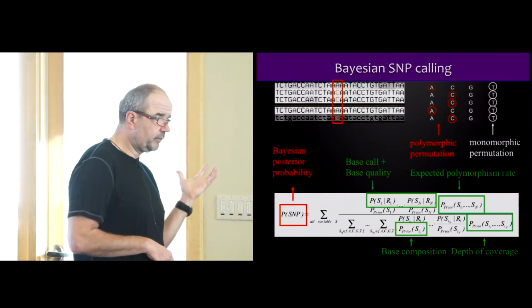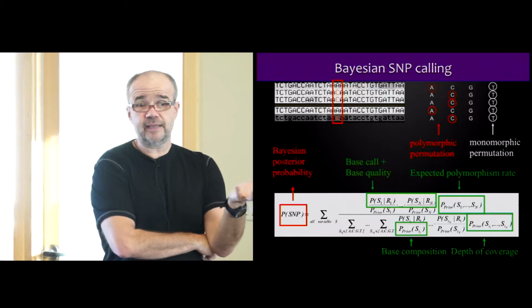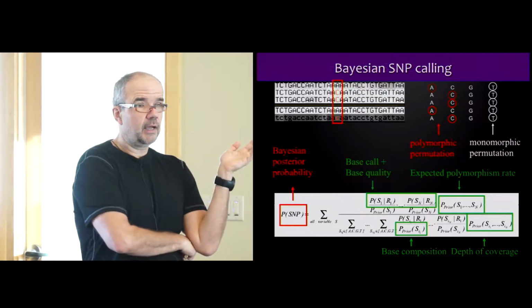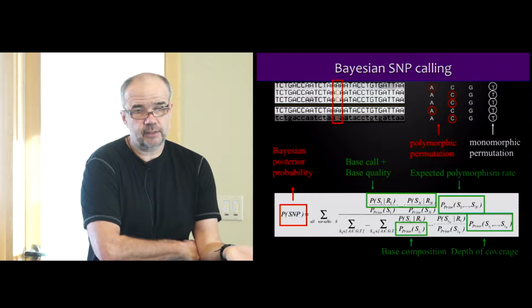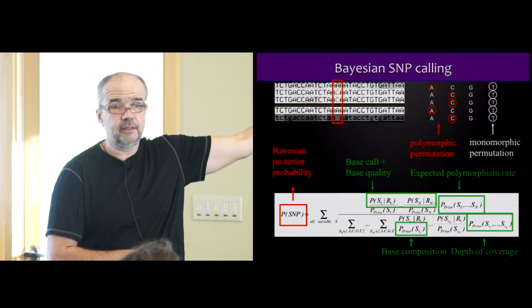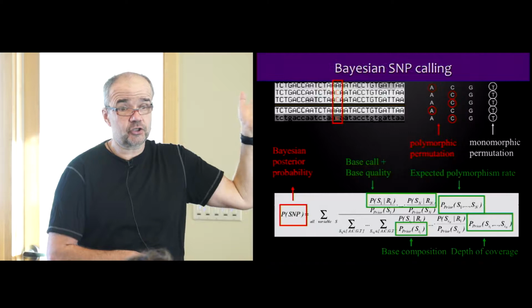So basically what you see in, I think you guys learned about the VCF file, the variant call format file, that reports genetic variants after a computational extraction of sequence variations, right? So basically what makes it in there is a variant that has high enough likelihood to be reasonably confident that it's a genetic variation, okay?